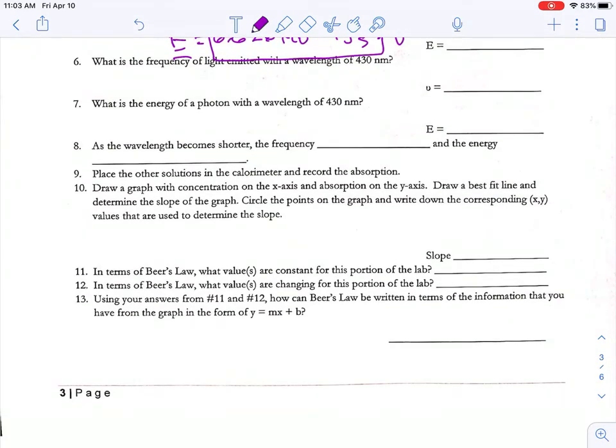Now, on this one, you're going to draw a graph. You're going to put concentration here, and you can leave that in micromolarity. And then you're going to have absorbance here. This is going to give you a nice linear graph, except you're going to have an outlier out here on that 25 micromolar point. So don't worry about that.